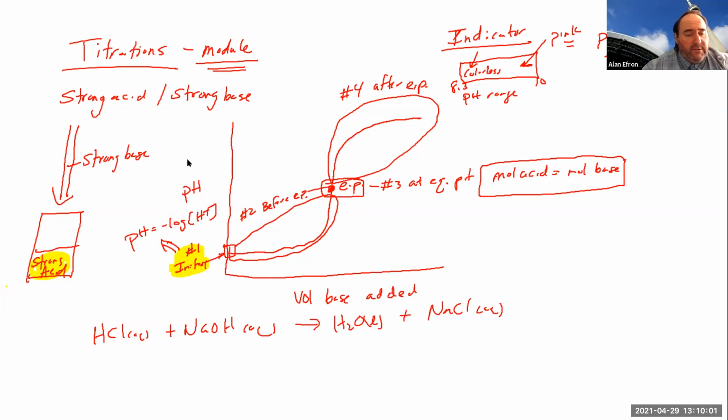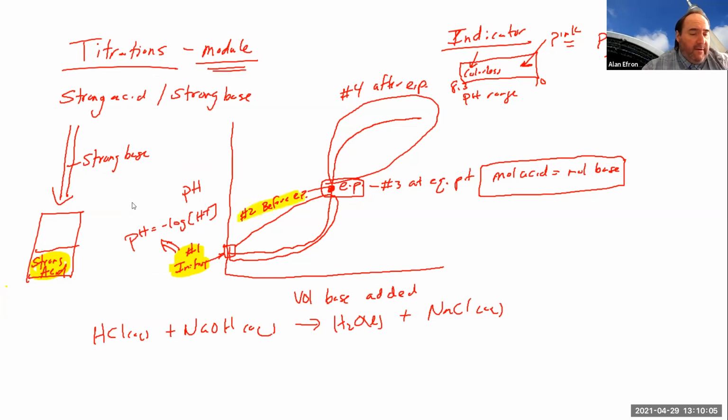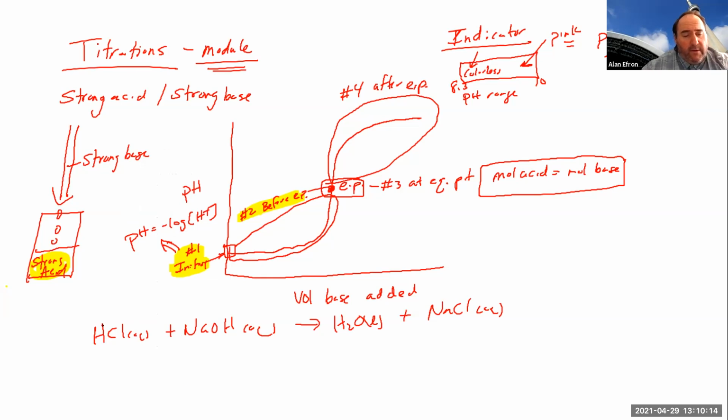It's really once you start the titration, kind of in this part, that you've obviously now started adding some of our, say, sodium hydroxide in this example. So we're adding. And that requires you, right, to do an ice table, as we talked about. And the purpose of the ice table in this particular case is we are definitely before the equivalence point, which means this is what we're starting with.